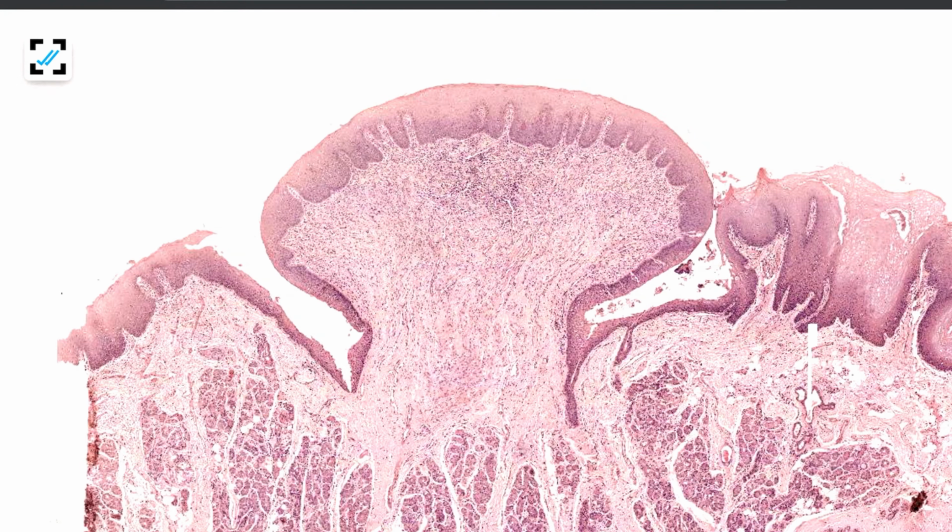As we can see in this field, circumvallate papilla are the largest of the lingual papilla. They are about 8 to 12 in number and are arranged as a single row parallel to the sulcus terminalis. Why exactly it is called as circumvallate papilla? When this papilla is viewed from above, each papilla appears round, measuring about 1 or 2 millimeters in diameter and is surrounded by a deep trench and a mucosal elevation by the side referred to as vallum. Hence, it is referred to as circumvallate papillae.